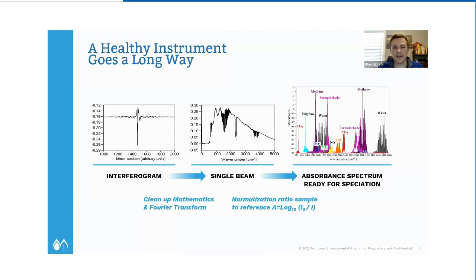So that's it. It generally takes a picture. We can see hundreds of things through a broad range of compounds, in this example formaldehyde, methane, ethylene, you name it. The list is quite extensive for our recipe list, and we have hundreds of these things that we can see. The tricky part is doing the picket fencing and all the chemistry to make sure that the recipe, the analysis, is accurate. And that's where validation is so important.